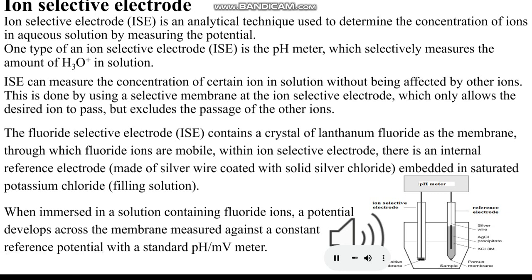Bismillah ar-Rahman ar-Rahim. Dear students, this is the course of instrumental chemistry, experiment: ion selective electrode. Ion selective electrode is one of the electrochemistry experiments, electrochemistry that measures potential.